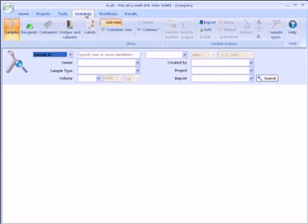Samples are managed by clicking on the material screen. This screen presents you with a list of criteria on which you can search for samples, as well as options to apply to samples in the ribbon control.